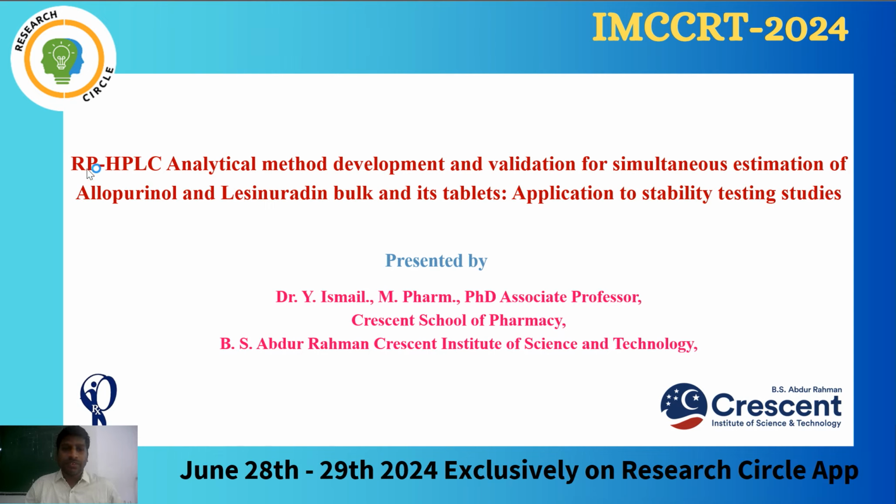So, what does RP-HPLC mean? It's reverse phase high performance liquid chromatography. It's a separation technique which is used to separate the components from a mixture.